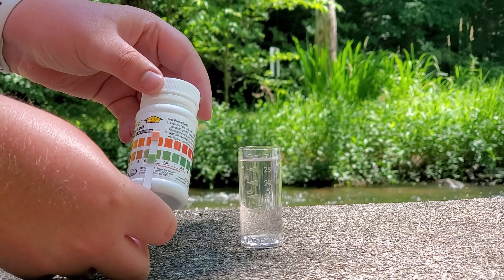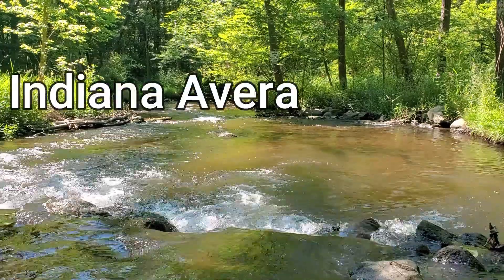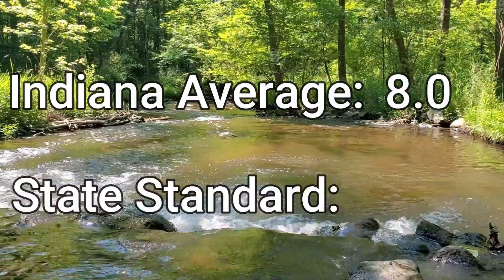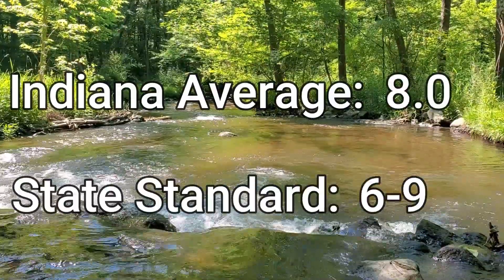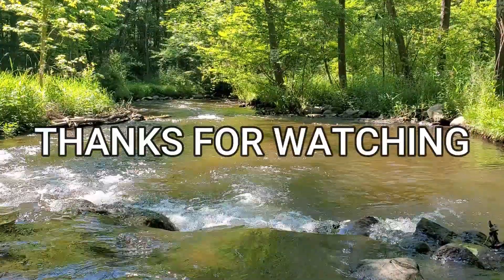In this case, the sample is about 6.5. The Indiana average is 8.0 for pH. The state standard is between 6 and 9.